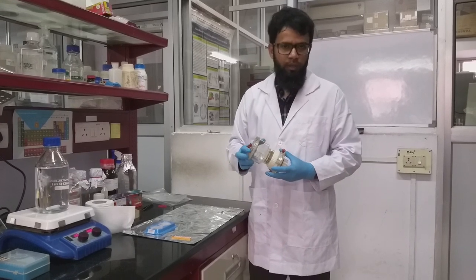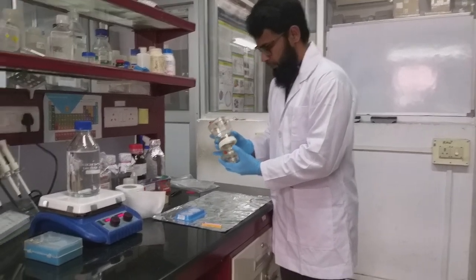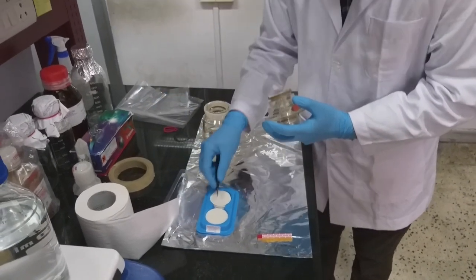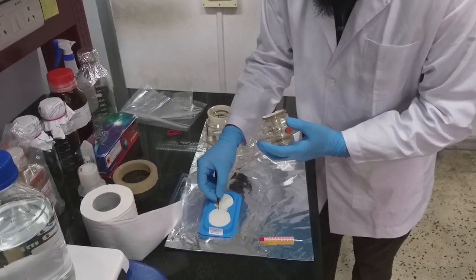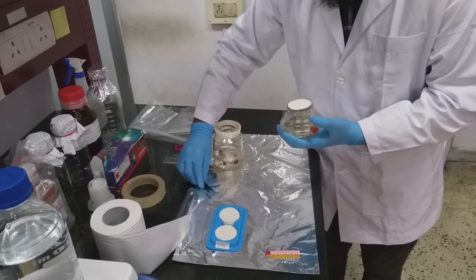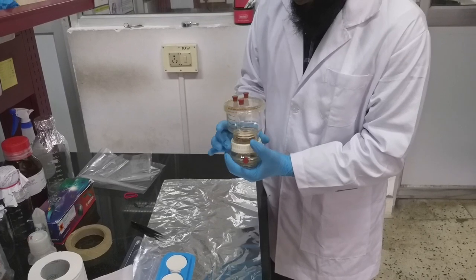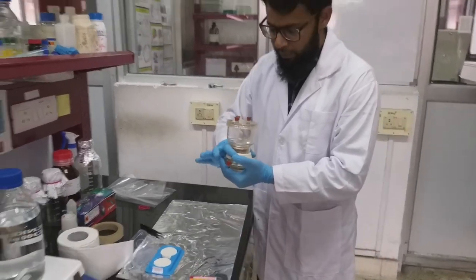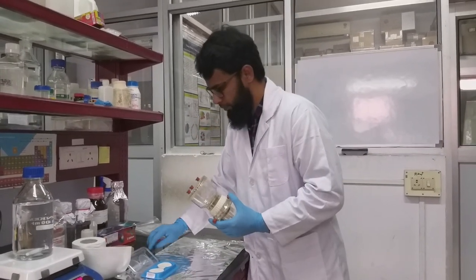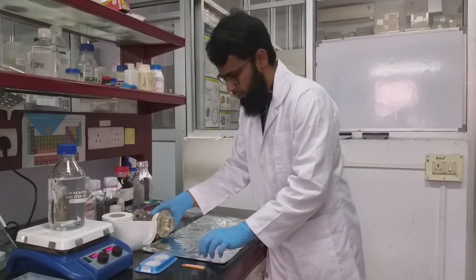This is a 250 ml bottle top filter. Now I will be demonstrating how to prepare filters for media. We have to pack it closely so that it doesn't allow any leakage, and after this we have to put it for autoclave. This is an autoclavable bottle top filter.